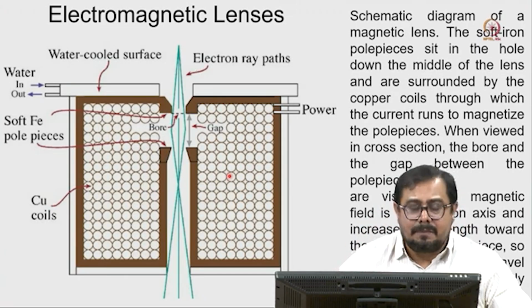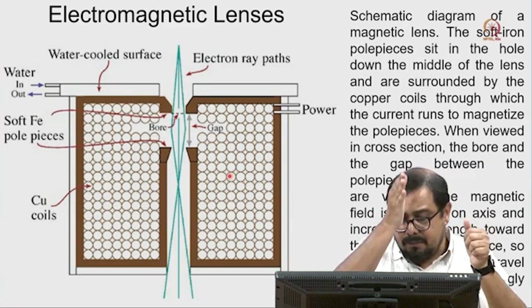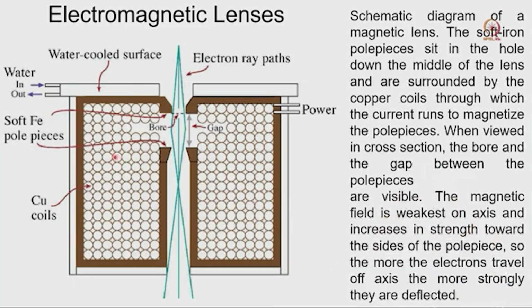Now what are the deflector and stigmator? They basically maintain the electron beam along the optical axis. If we consider this diverging electron beam which is converged at one particular point, near the gap region the magnetic field helps converge the beam at this point. But if there is any deflection, if the beam is not coming through the optical axis, who is going to regulate that?